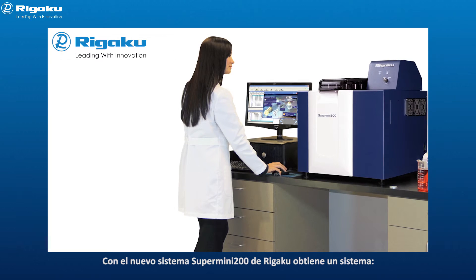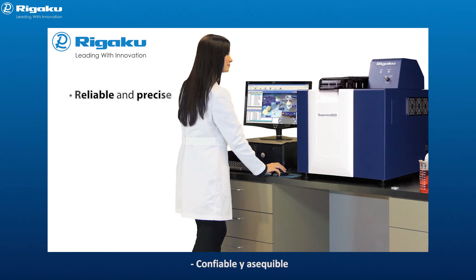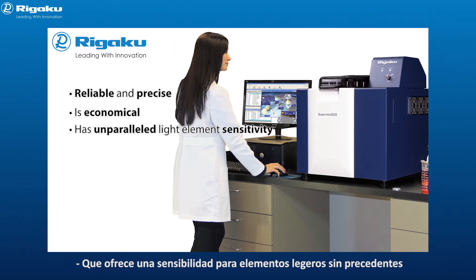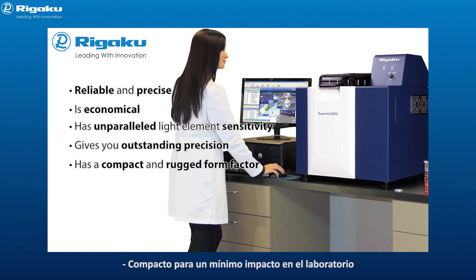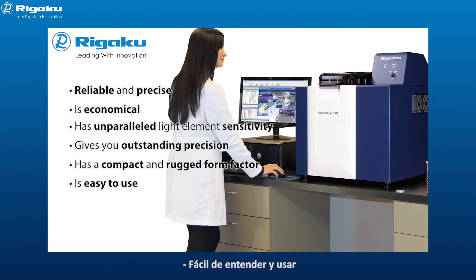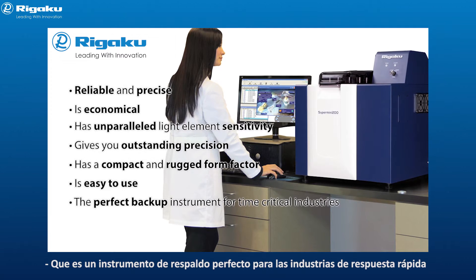With Rigaku's new Supermini 200 system, you are getting a system that is reliable with low true cost of ownership, provides unparalleled light element sensitivity, delivers outstanding precision, has a compact form factor for minimal lab footprint, is easy to learn and easy to use, and is the perfect backup instrument for time-critical industries.